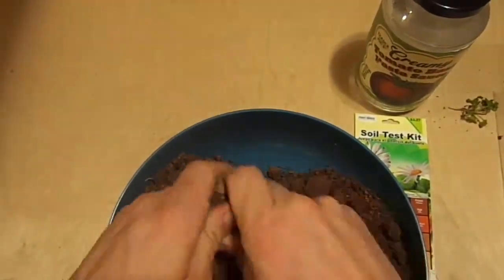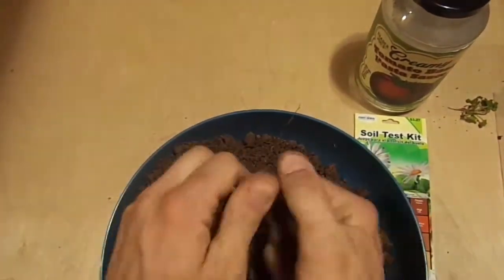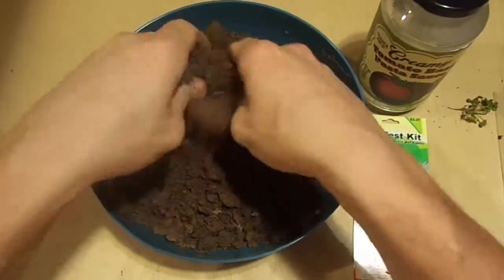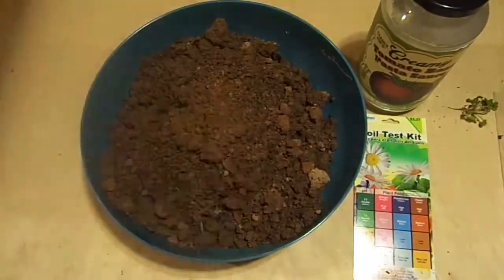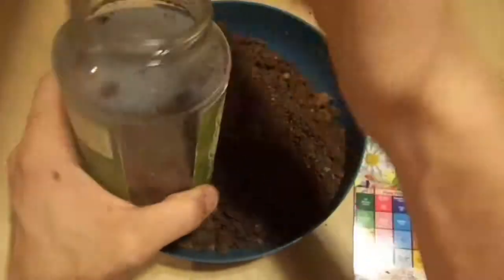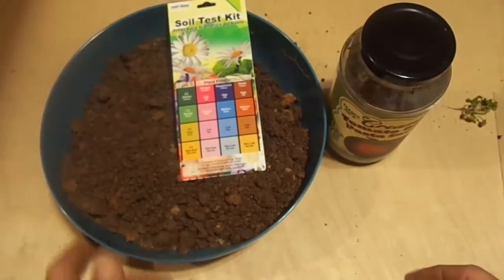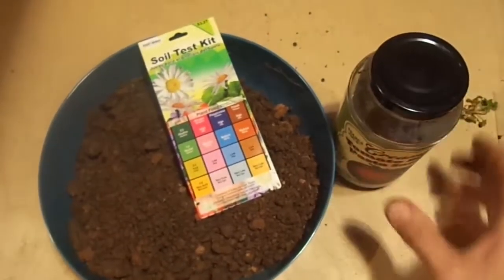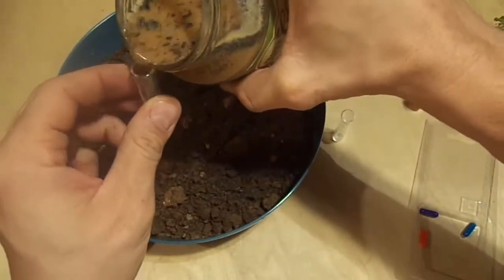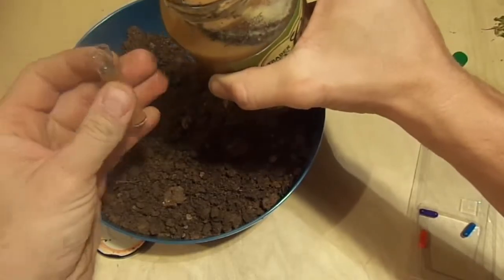However, one mistake I made was that I used city water, which certainly could have skewed the results. Secondly, they put the test powder in these little capsules that you'll see throughout this review, and when you pull the capsule apart to dump it in the tube, they were so full of the test powder that I spilled some of it. So again, I don't know how accurate the test ended up being.